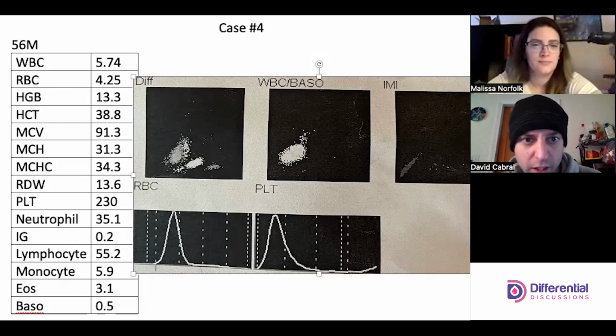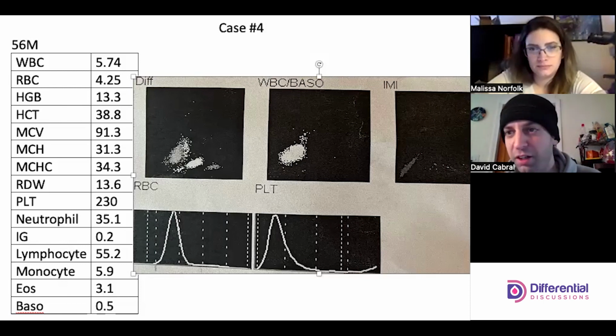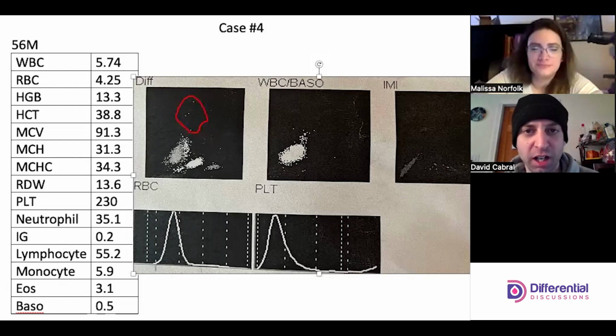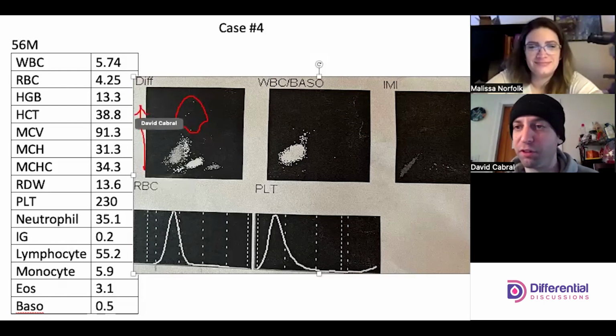So I'm looking at these. It was meant to be circular for the audience. But I'm just looking at those small dots. So this part of the scale here, our y-axis, as this increases, that's an increase in the fluorescence of those particular cells.